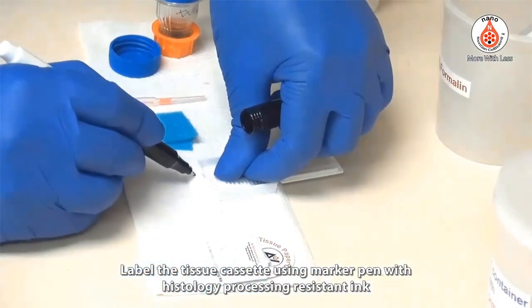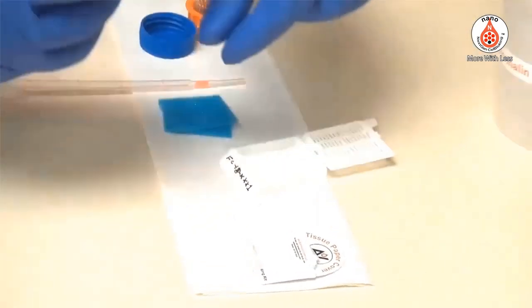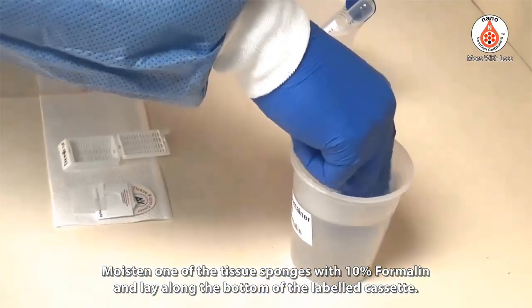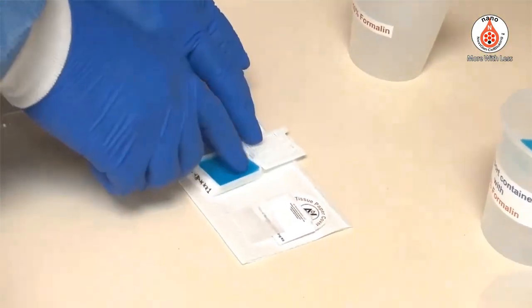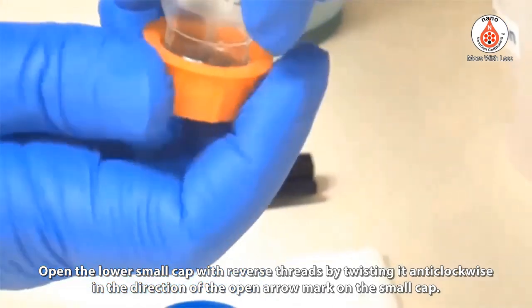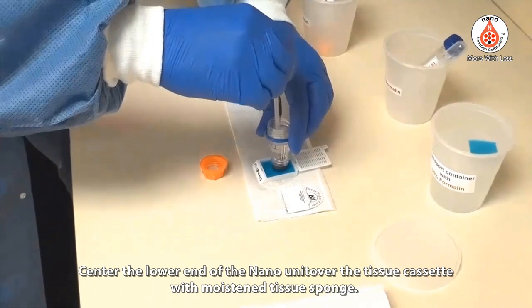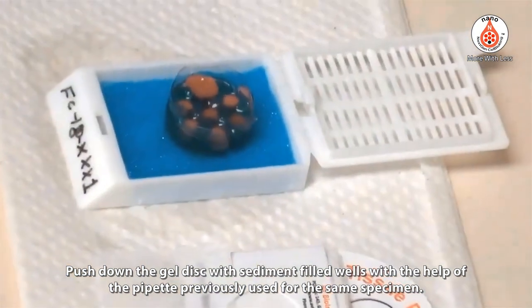Label the tissue cassette using a marker pen with histology processing resistant ink, and check the labeling. Moisten one of the tissue sponges with 10% formalin and lay it along the bottom of the labeled cassette. Open the lower small cap — which has reverse threads — by twisting it anticlockwise in the direction of the open arrow mark on the small cap. Center the lower end of the Nano unit over the tissue cassette with the moistened tissue sponge, then push down the gel disc with sediment-filled wells using the pipette previously used for the same specimen.